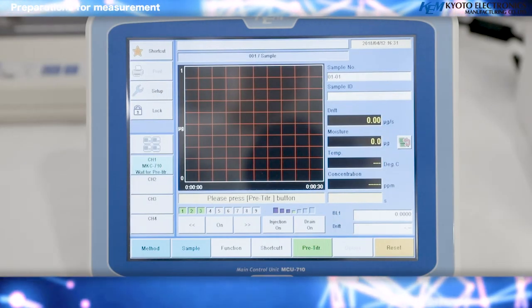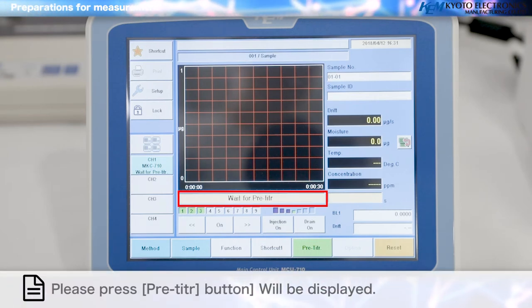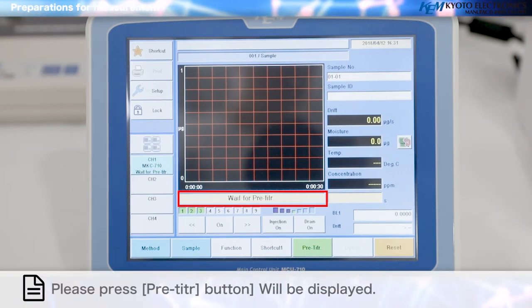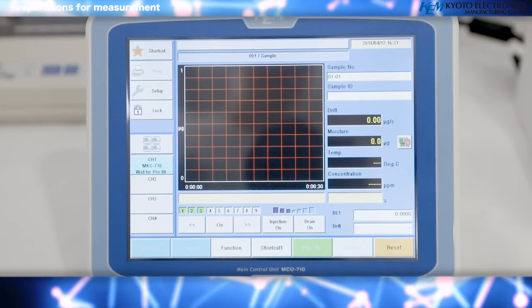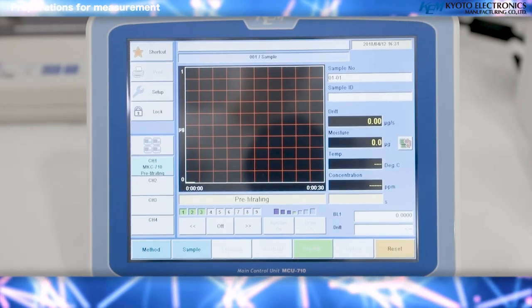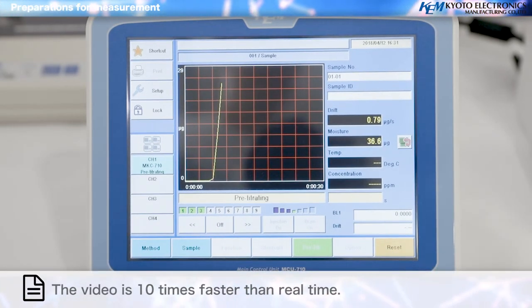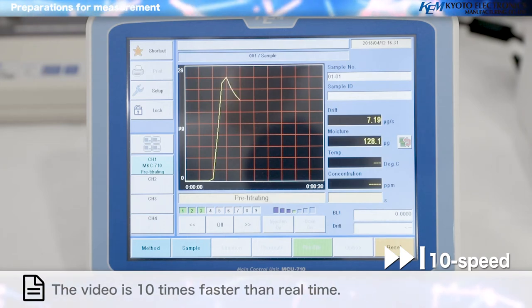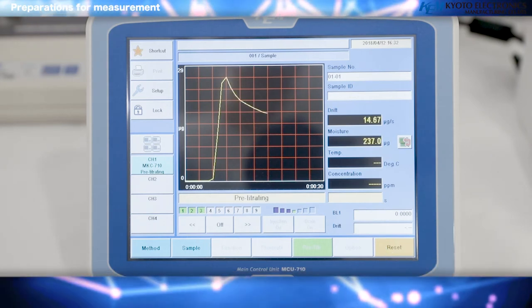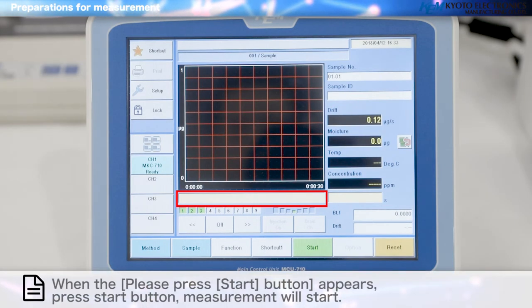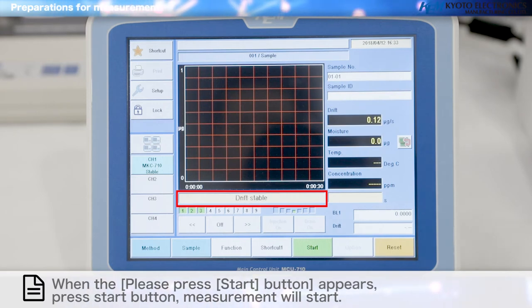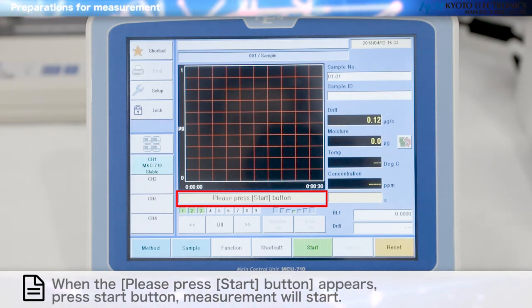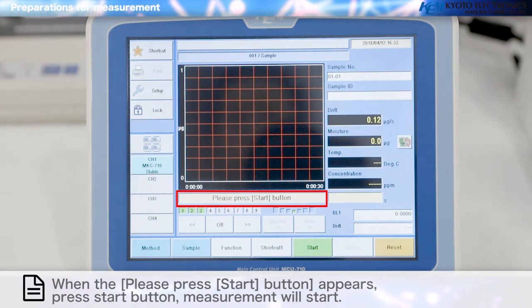Preparations for measurement: first, carry out the pre-titration. Press the pre-titration button — it will be displayed. Press the preliminary titration key and pre-titration will begin. When the pre-titration is finished, wait until the drift value stabilizes. The 'wait till drift becomes stable' display will change to 'drift stable.' When 'please press start button' appears, press the start button. Measurement will start.